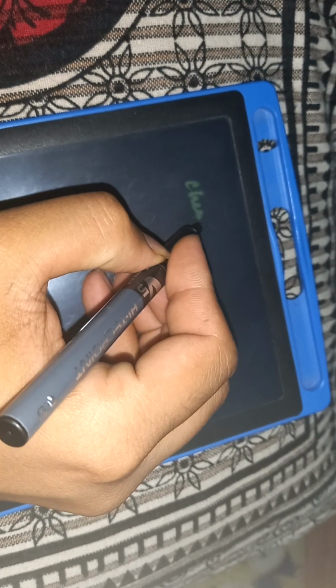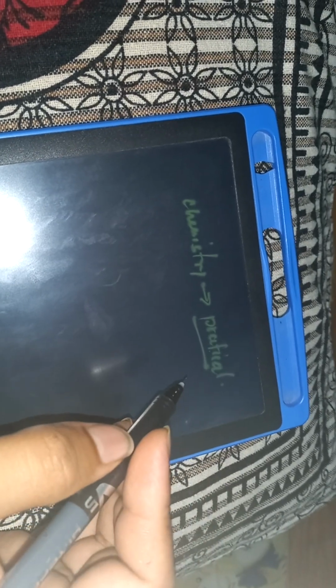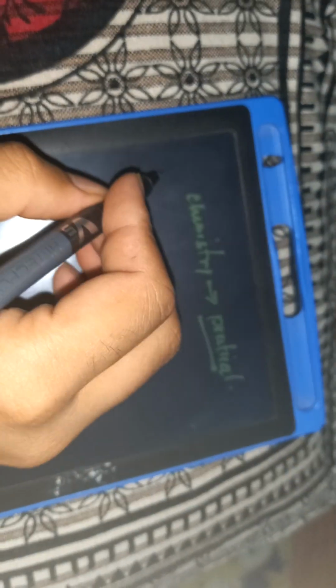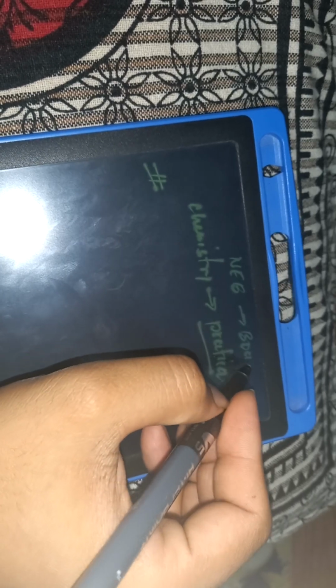Today we will be learning chemistry practical in a very easy and simple manner. No need to look for other videos after this. Our main focus is the chemistry practical in NEB. I am talking about the NEB board, so you should be concerned about this.